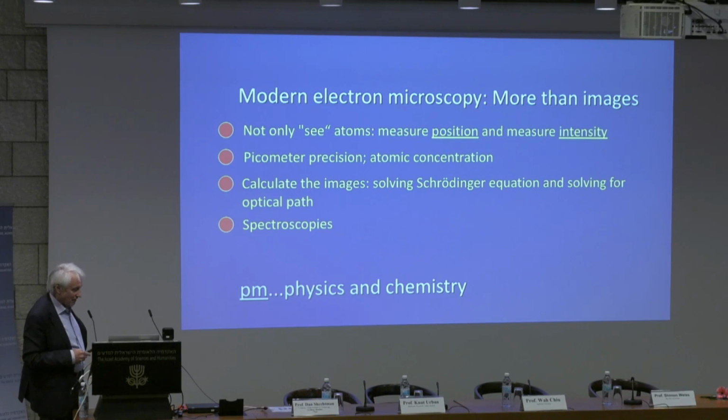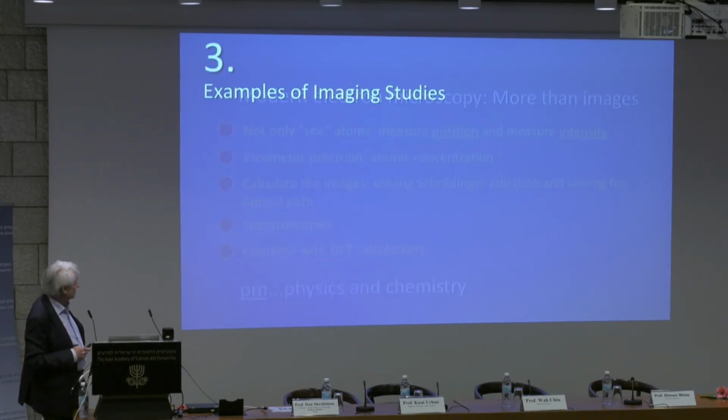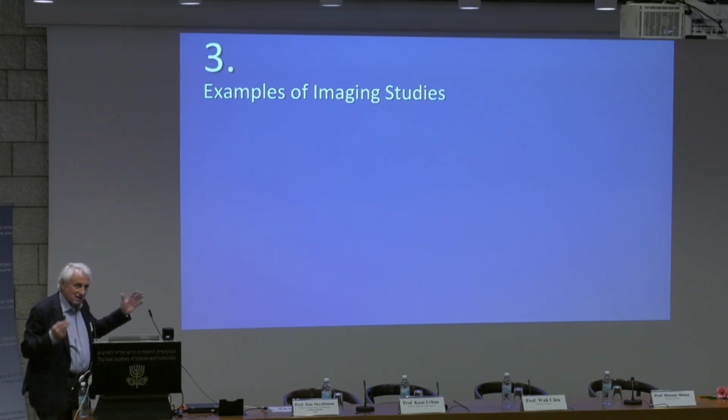And there we have this wonderful technique of DFT calculations. So some of the work today is done in tandem, high resolution and DFT calculations, to better understand the results. So now examples, and the important point in all these examples is I'm not discussing them down to any physical or chemical detail. I only want to show you in a comprehensible way what electron microscopy in atomic dimensions can do. That's all you should take home, not the details.